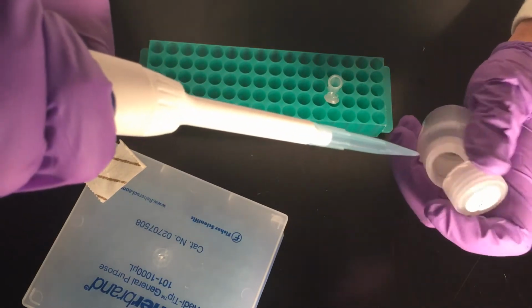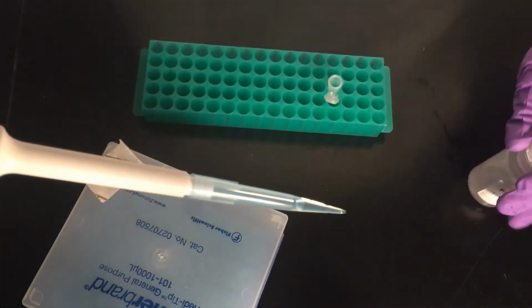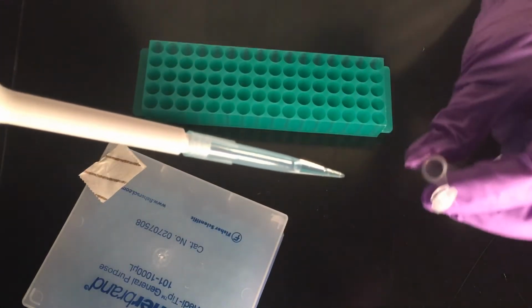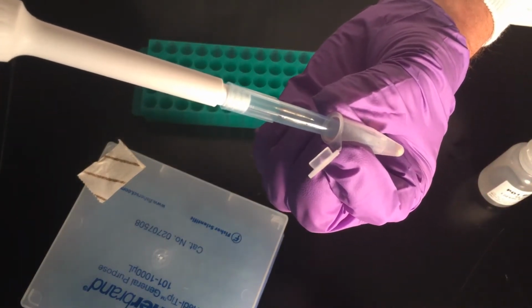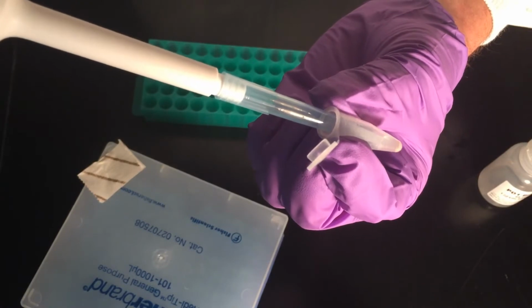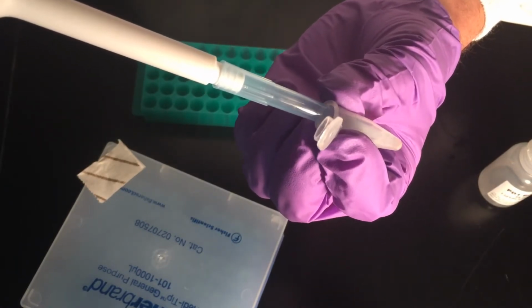The way I'm going to do this is basically get the solution. You can see that's what 200 microliters looks like. I'm going to resuspend the cells, and the way I'm going to do that is basically by pipetting up and down until the cells are in solution. I'm going to continue to do this, and then I will proceed on to the next step.